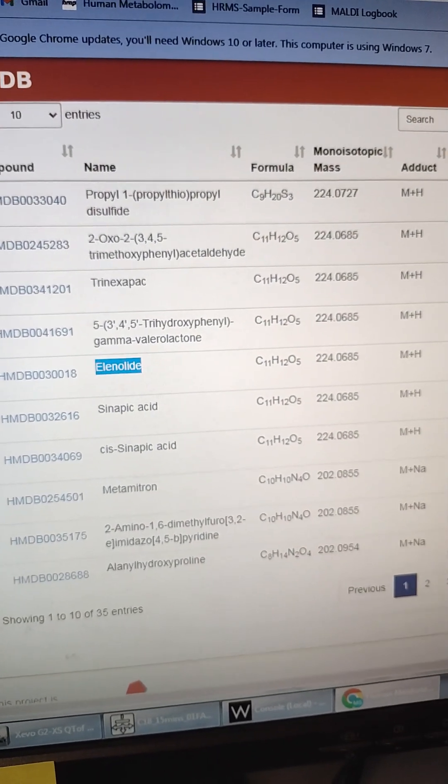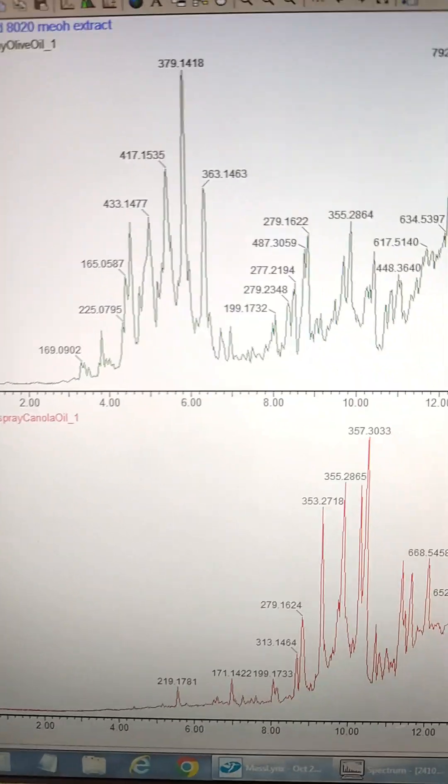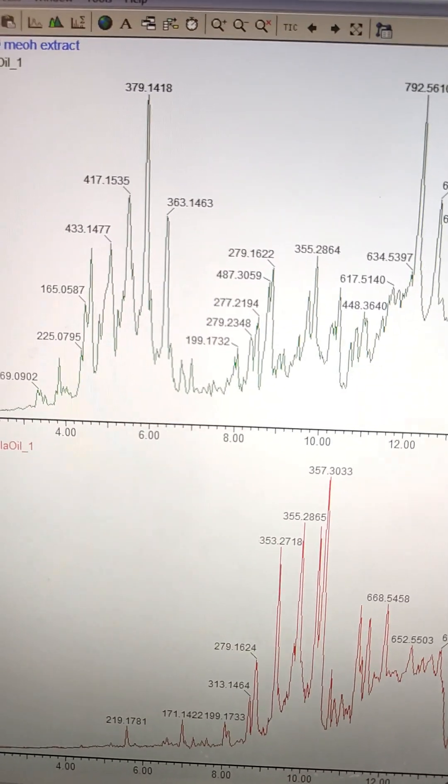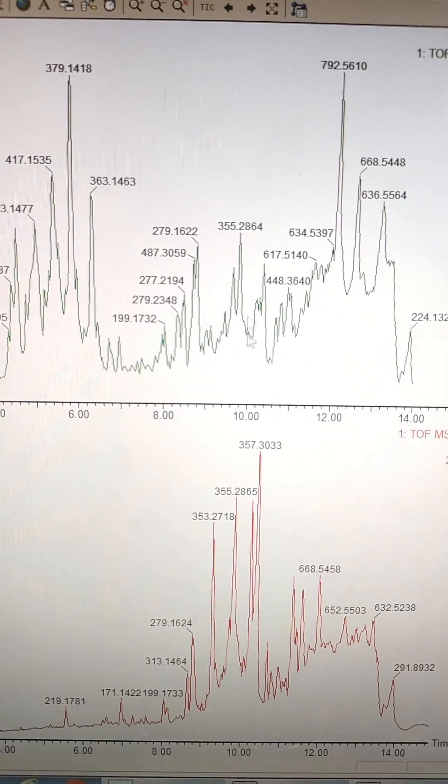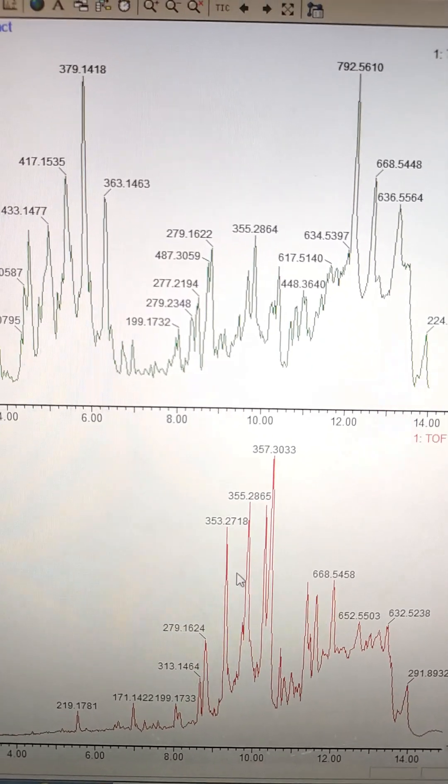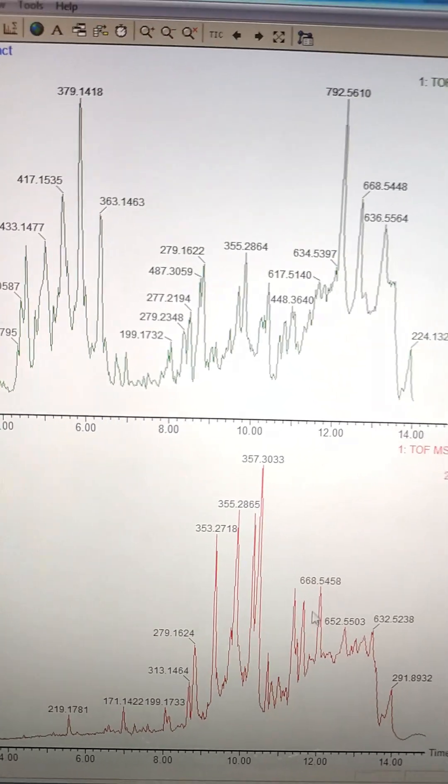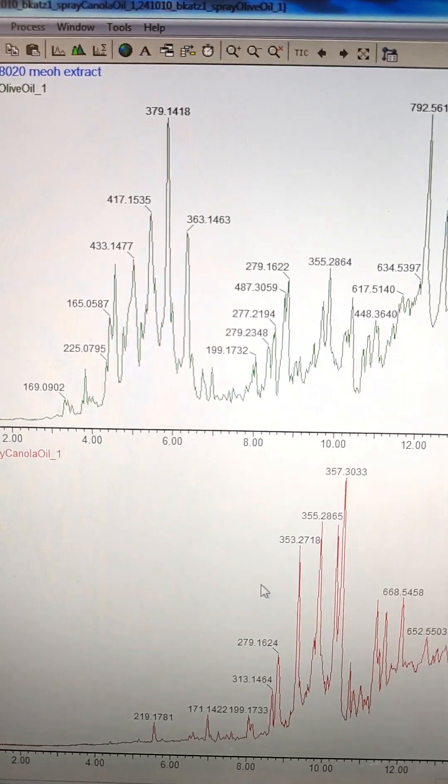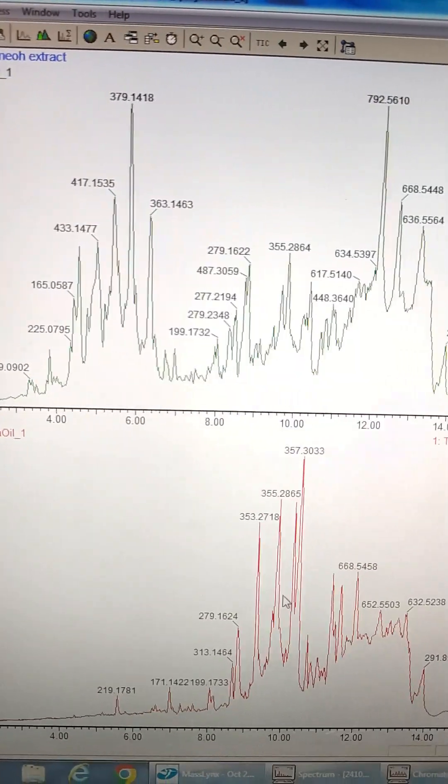This oil extraction method is fantastic. I mean, these couldn't look more different. I got to say. And that 355 peak right there is right on top of itself. So the chromatography and the 279. So it's not a chromatography issue or a carryover issue. It just looks like we got a great oil method. Pretty excited to try this on other things.